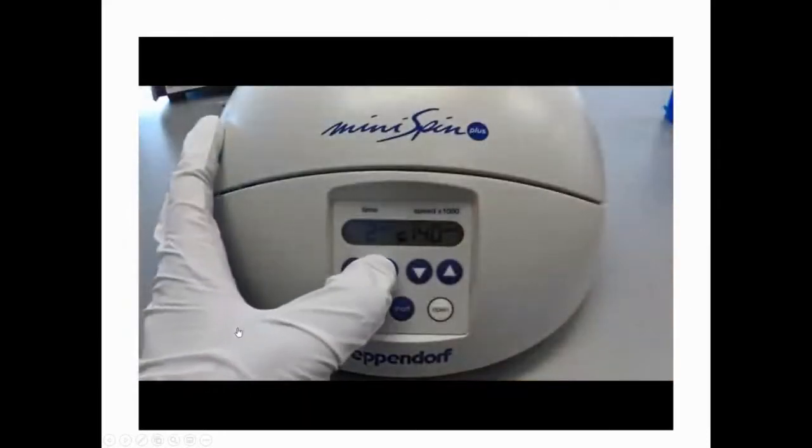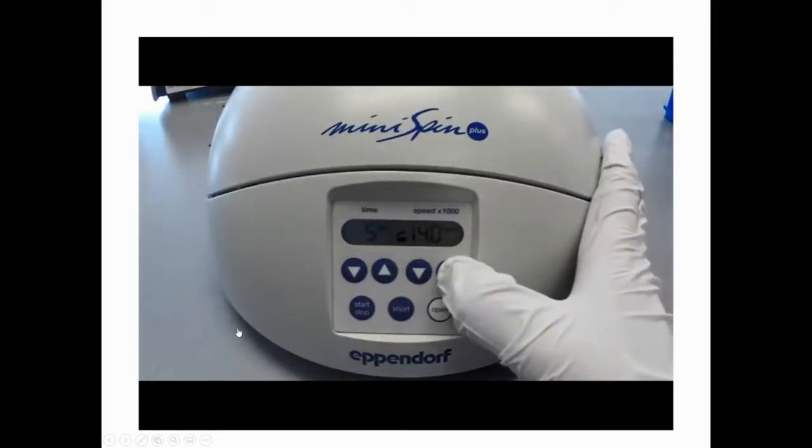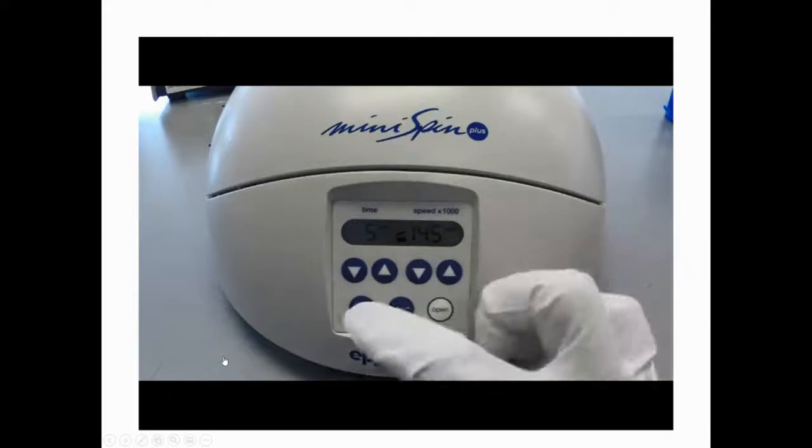Change the centrifugation time by pressing the arrows to the desired time, in this case, 5 minutes. Press the arrows by the speed to navigate to the proper RPM. The speed is in RPM, revolutions per minute, multiplied by 1,000, so that's 14K. That's normally what you can do for the microcentrifuge. In this case, 14.5 thousand RPM is the max this centrifuge can perform and is close enough to our desired speed. Press the start button.